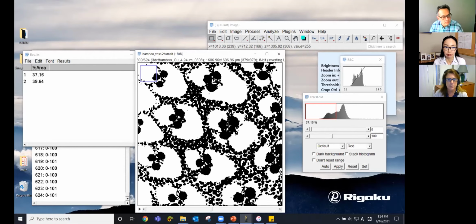All right, so our question in this case is, how can we add plugins? Would you execute the plugin installer to add the plugin? Would you copy and paste the Java source code into the ImageJ source? Or would you copy the plugin file to the ImageJ Fiji plugin folder? And we'll give a few seconds to get everybody's vote in. And it's pretty heavily leaning one way. So I'll just leave a couple more seconds, and now I'll close the voting and I'll share the results.